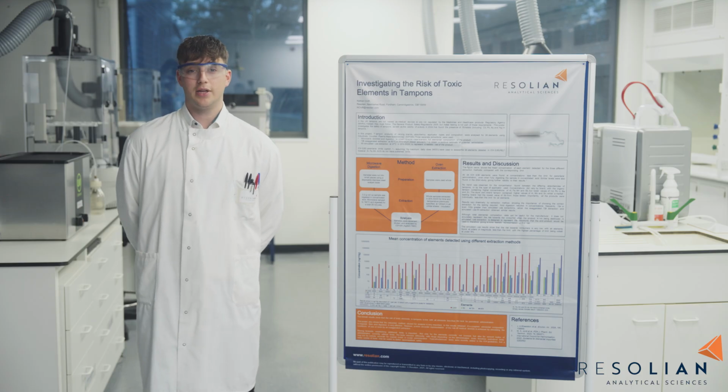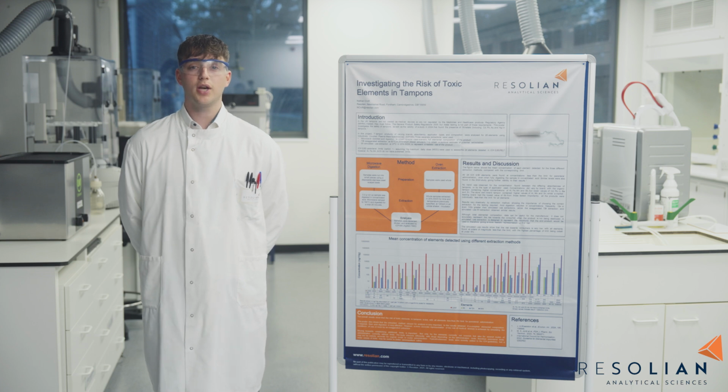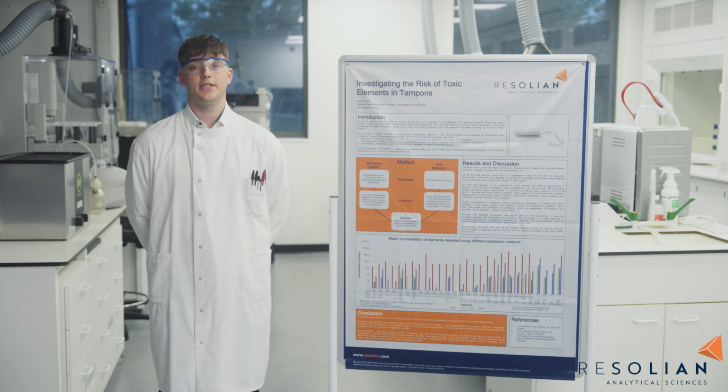And thirdly, a simulated use extraction. A whole sample was left in 20% ethanol at 37 degrees for 6 hours. This was to replicate a realistic use of the product.